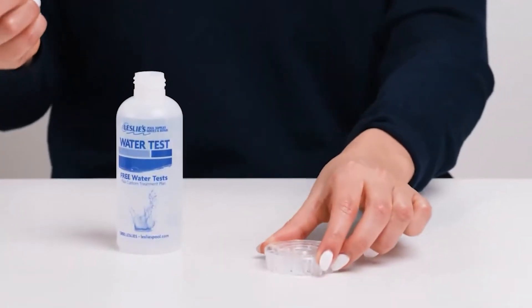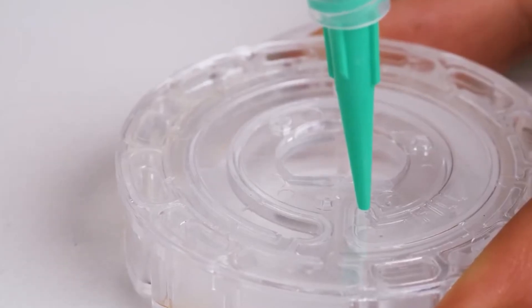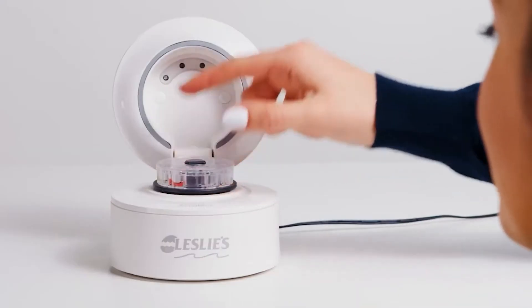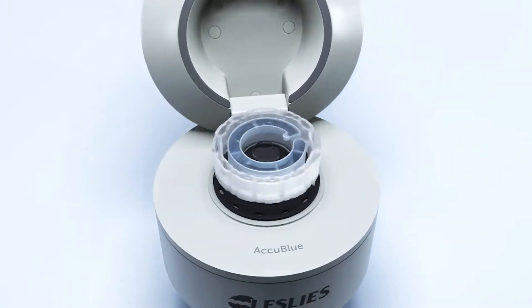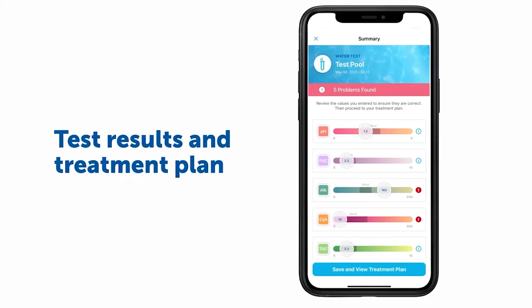Using the AccuBlue Home device is simple — just fill the test desk with pool water, place it in the device, and start the test from the Leslie's app on your smartphone. In just 60 seconds you'll receive a comprehensive chemistry analysis for 10 different aspects of your pool water. AccuBlue Home goes beyond just telling you what's wrong with your water — it delivers a personalized water treatment plan through the app with recommendations tailored to your pool or spa.